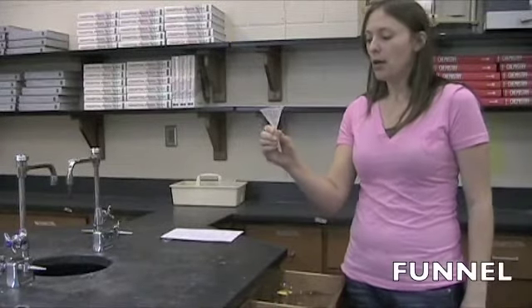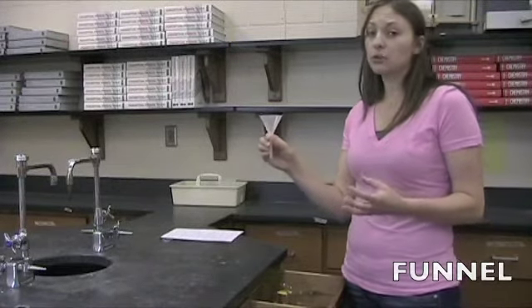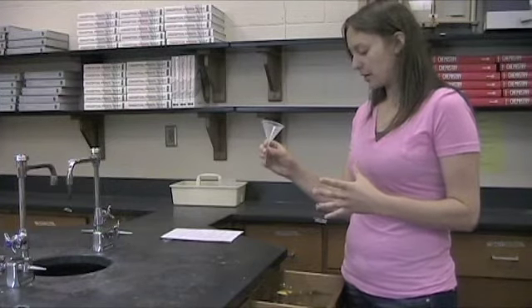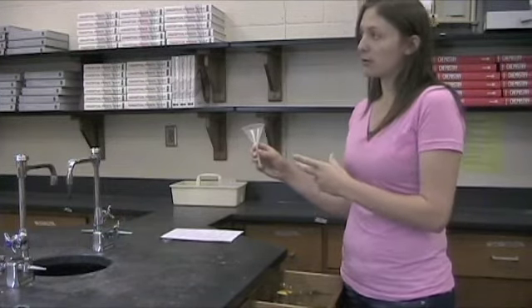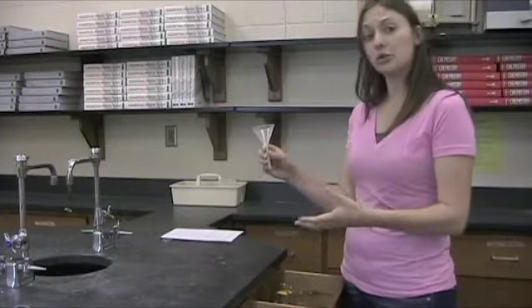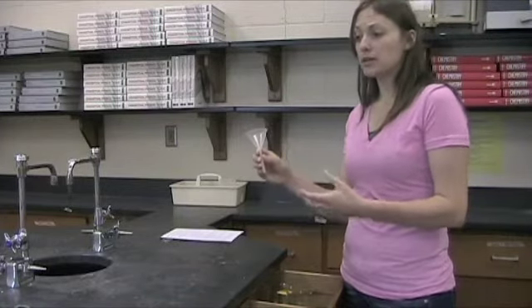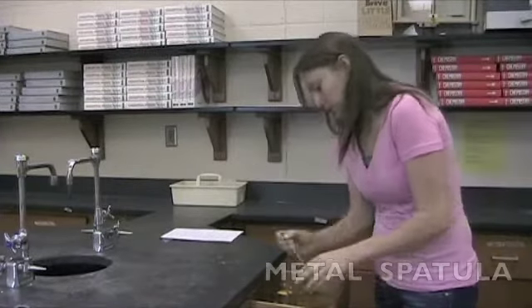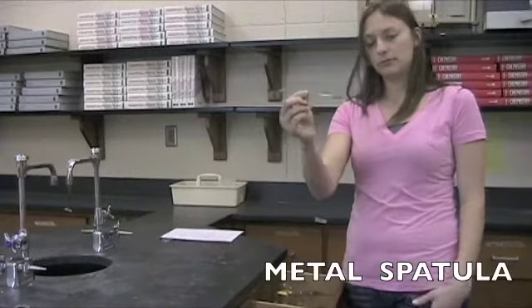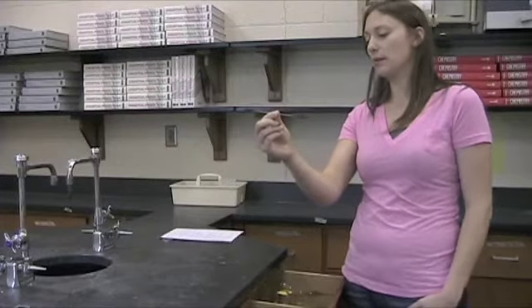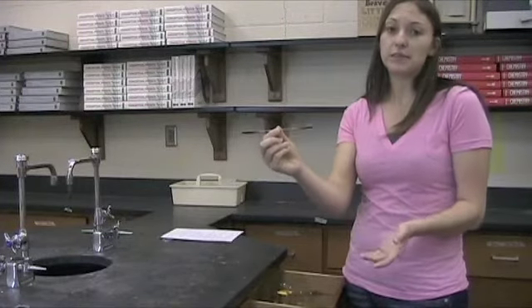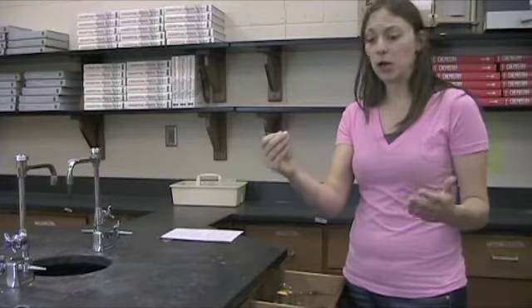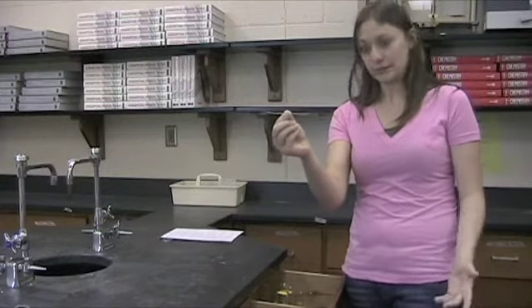Funnel. These are mostly used for liquids or solids that are very finely grained because the opening there is not very large. They're used to transfer liquids usually into a container that has a smaller mouth, smaller opening. You have a metal spatula which is often used to transfer solids from a container, to help stir, to scrape off the bottom of a beaker. It's used for a lot of different things.